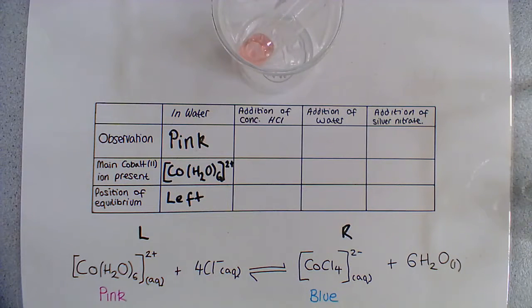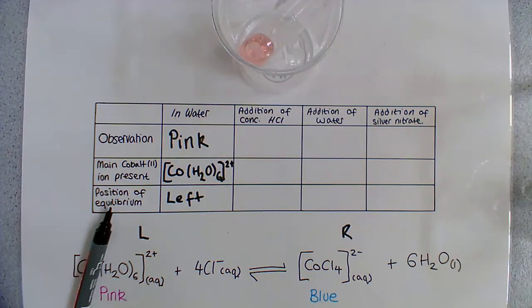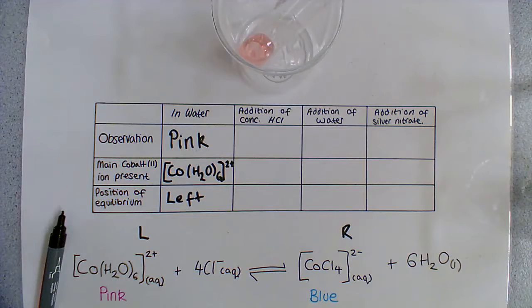We're now going to have a look at what happens when we add concentrated hydrochloric acid. The reason I need concentrated hydrochloric acid is because I don't want there to be any water present. So I'm going to add it in and we're going to observe what happens to the colour.